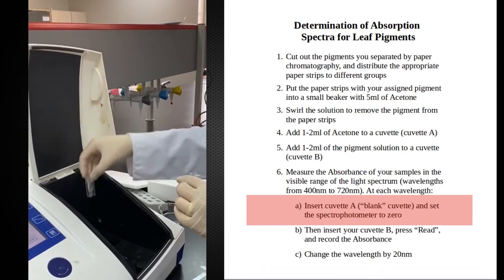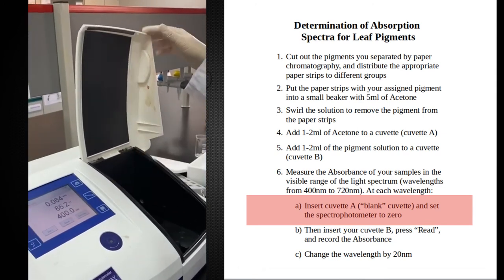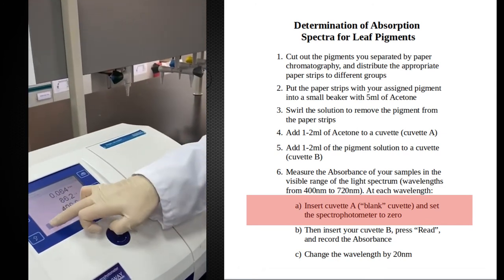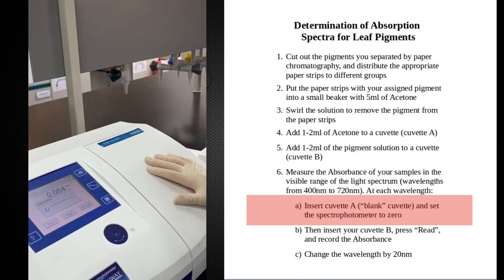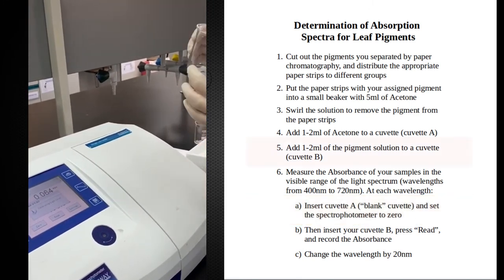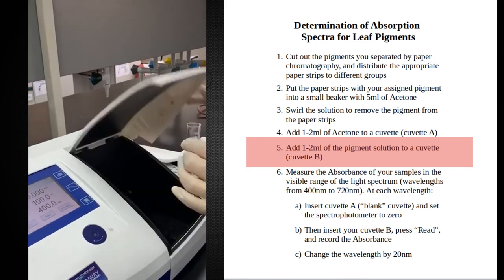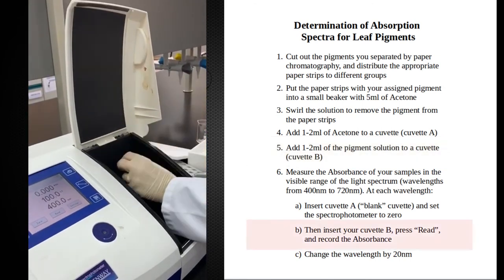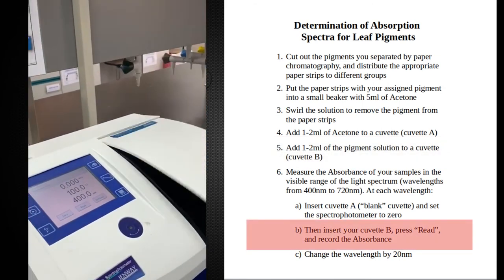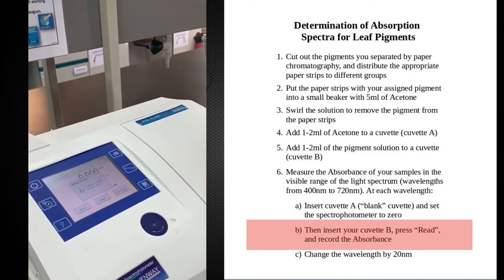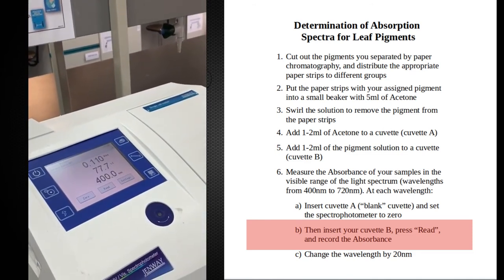So this cuvette contains acetone only. I'm going to calibrate my spectrophotometer. And I have put in this cuvette chlorophyll A. I will take the measurements of chlorophyll A at 400 nanometer. The absorbance is 0.11.